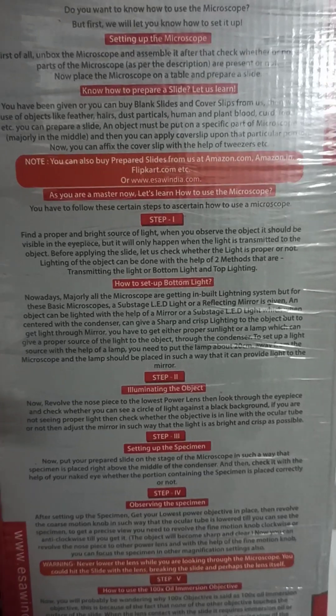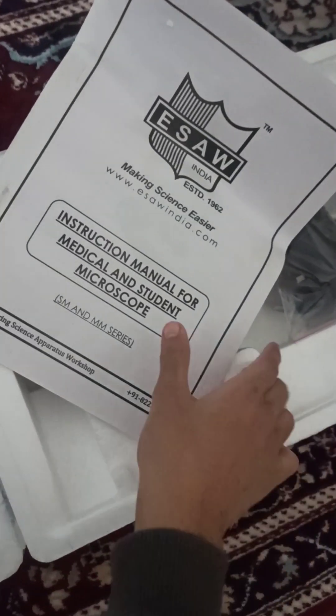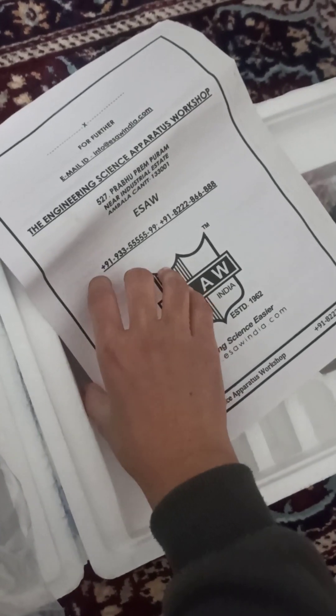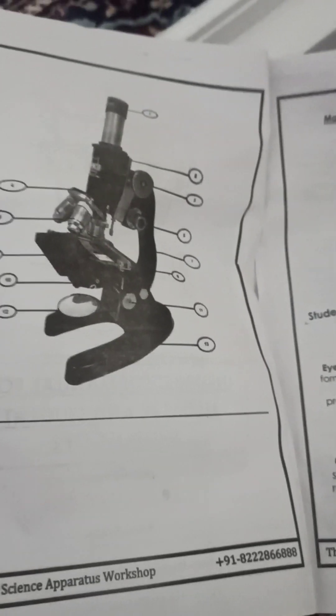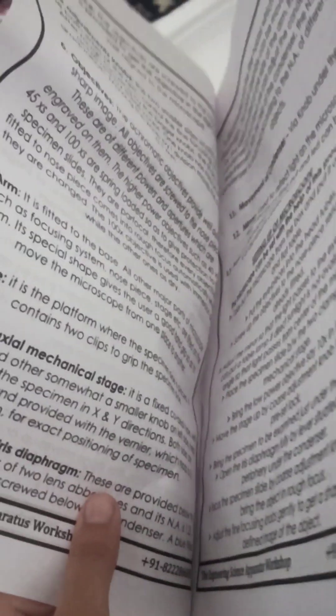The side of the box also shows instructions on how to use the microscope and how to prepare slides. When you open the box, you can clearly see the microscope and the other components. First of all, we are given a manual, which contains all the instructions on the components and how to arrange them.